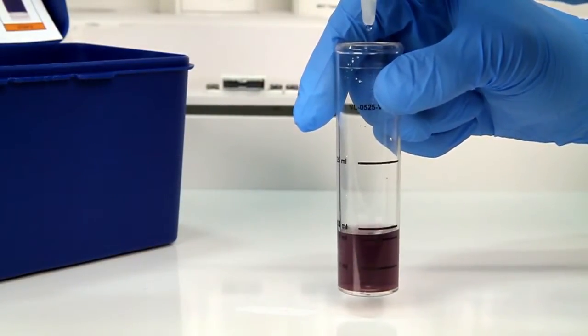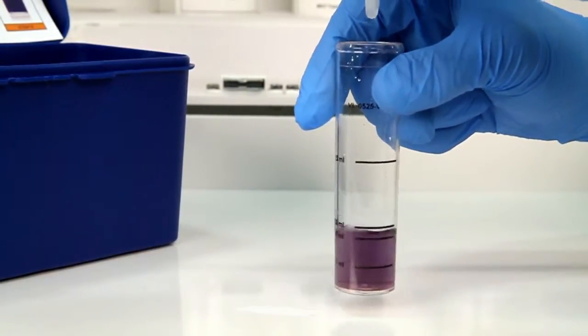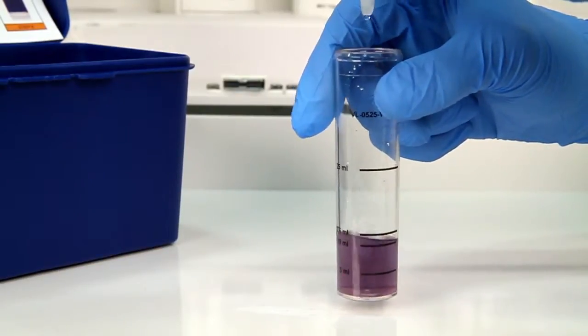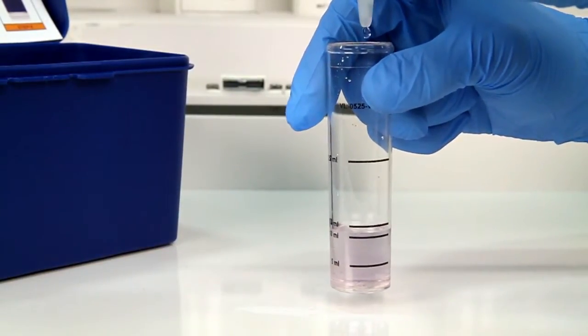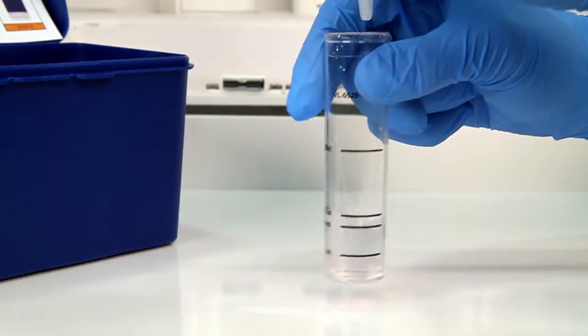After the addition of each drop of titrant, swirl the vial to make sure the sample is properly mixed. Count the number of drops during this step. The titration is complete when the sample turns colorless.